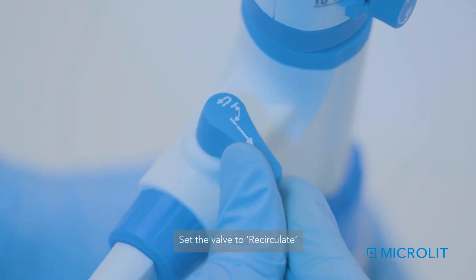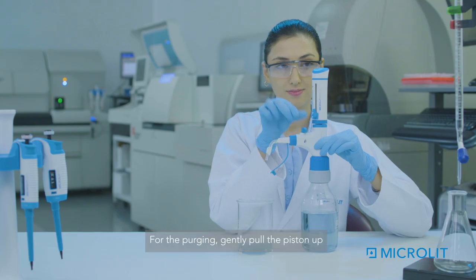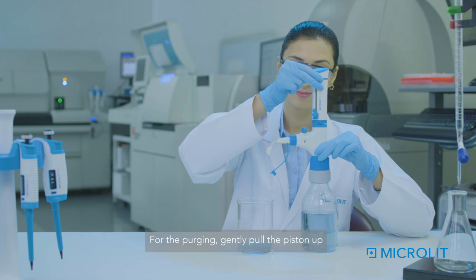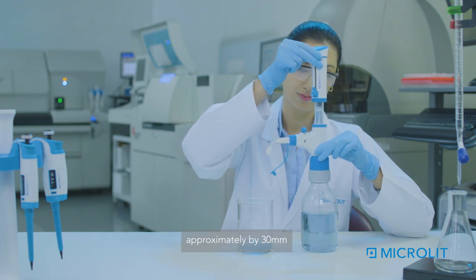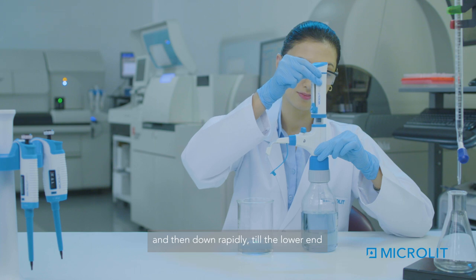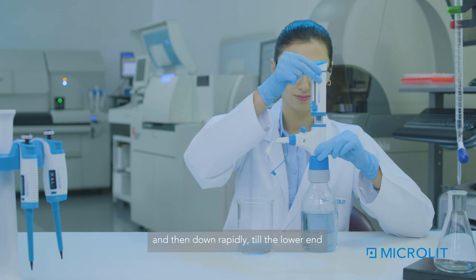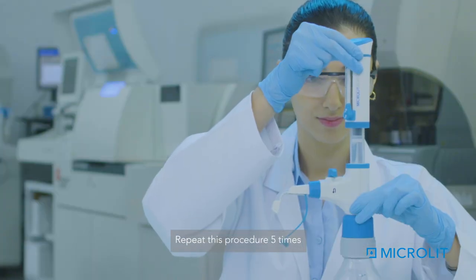Set the valve to recirculate. For the purging, gently pull the piston up approximately by 30mm and then down rapidly till the lower end. Repeat this procedure 5 times.